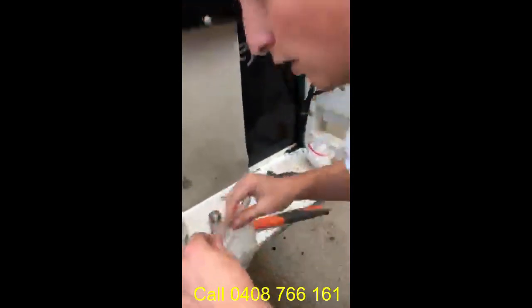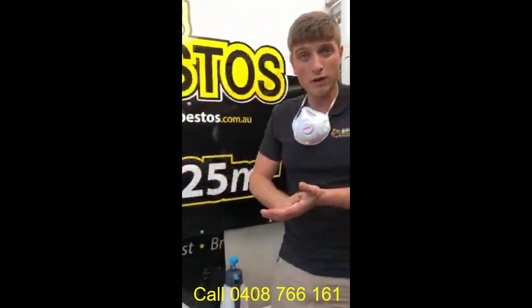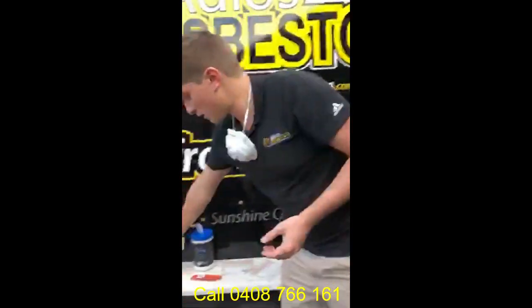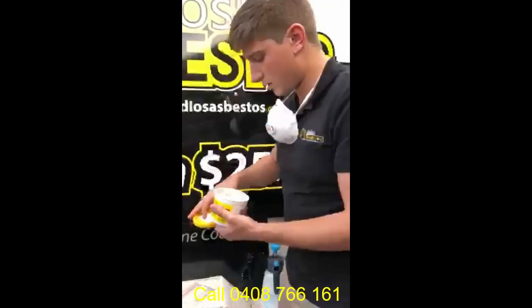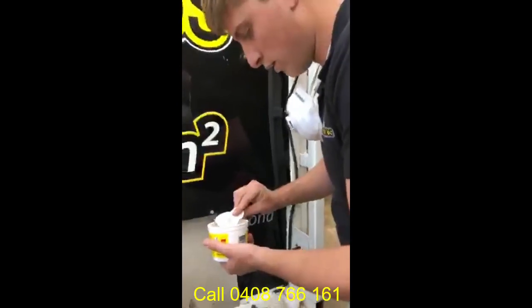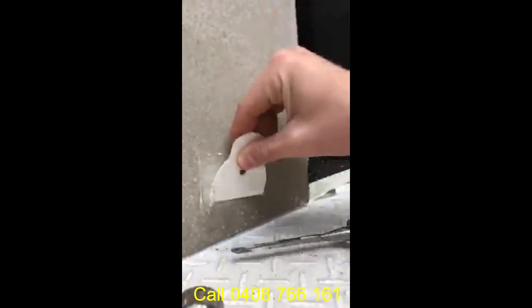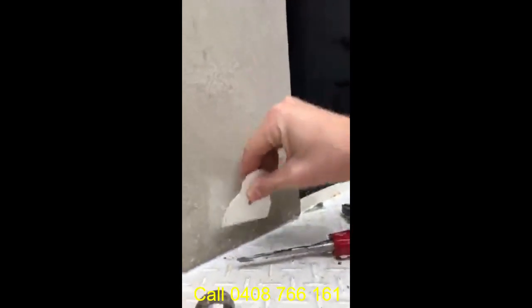And of course, if you're doing that in a concealed room, you want to seal it even further and make sure it's nice and contained. That's where the putty comes back into action. Simply apply the putty like we've shown you in other videos, just to seal it, and that is still in a nice concealed room, nice and discreetly behind a corner, above a skirting or something like that, nice and contained.